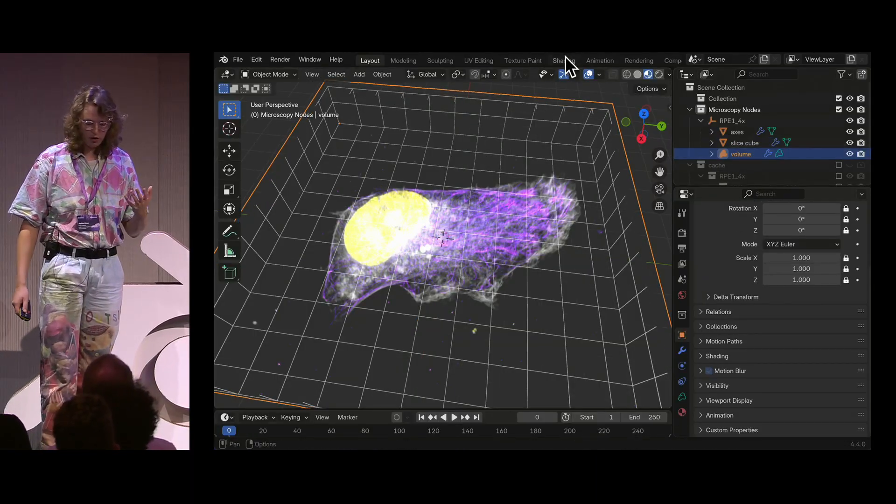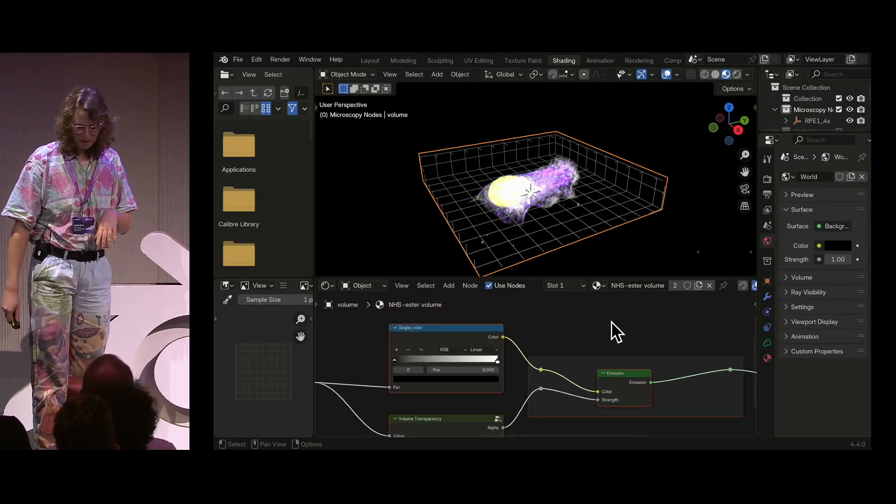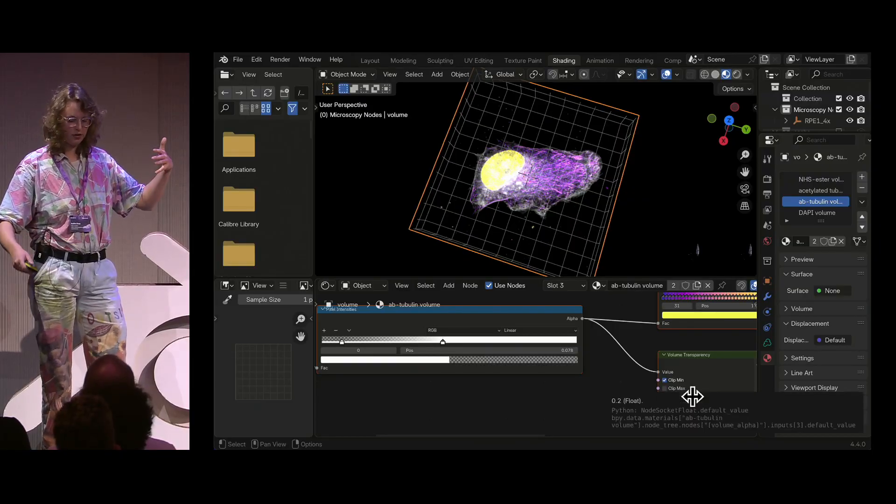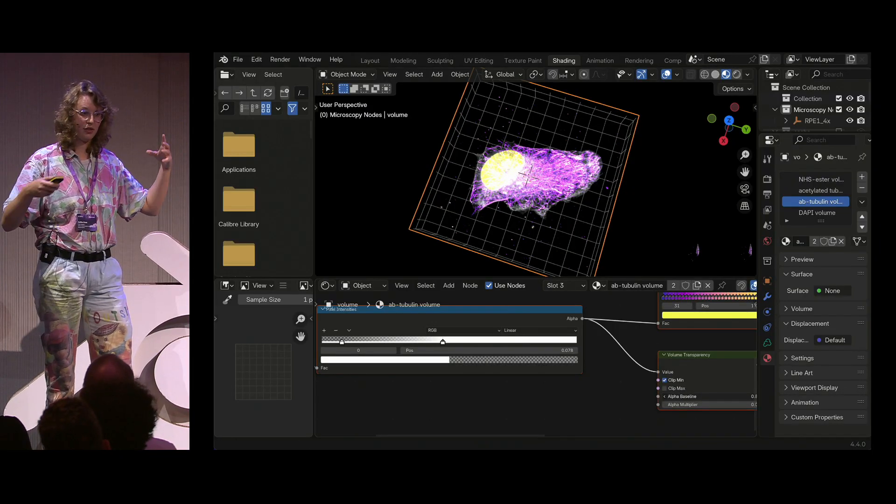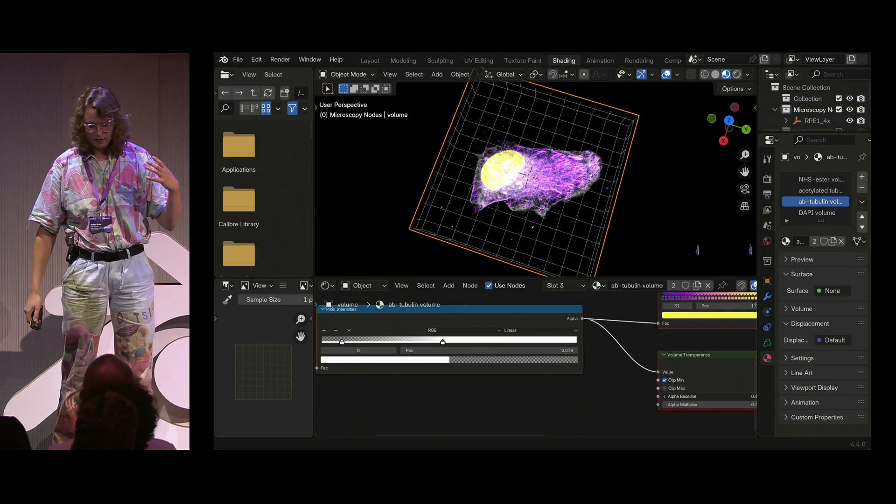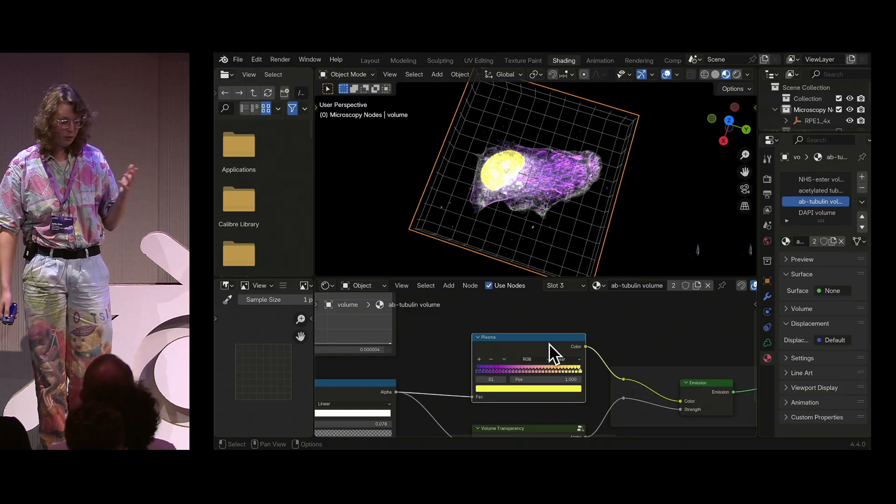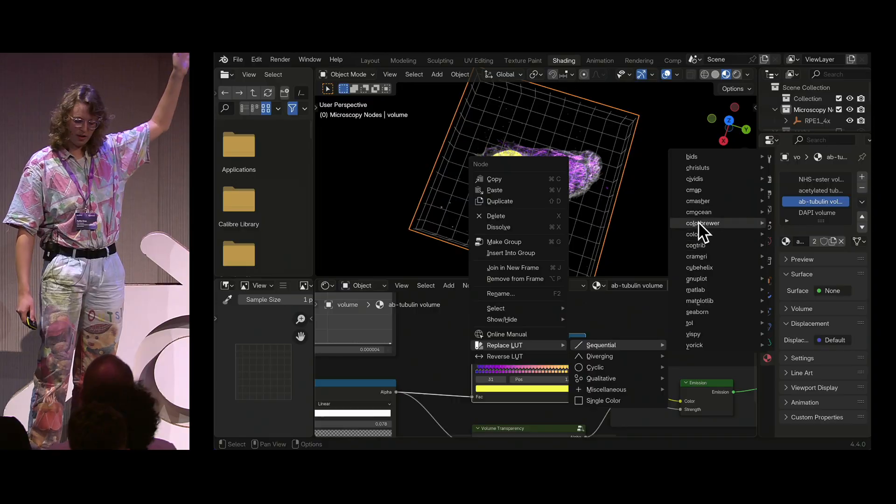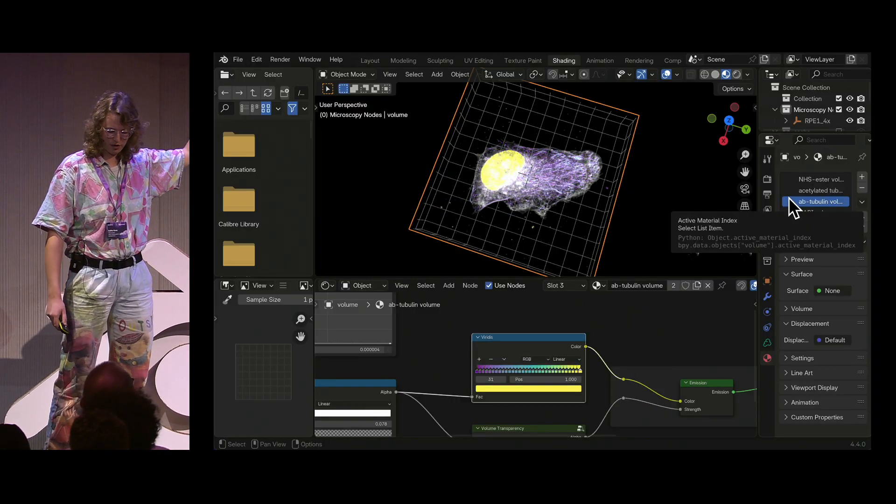And volumes. So the volumes have separate shaders for every channel, where you can select your min and max of all of your data. You can set your transparency, and you can set the color map that is selected. So right now we are in this scientific color map, and we can right-click, and we can select from hundreds of different color maps and quickly get to another scientific color map.